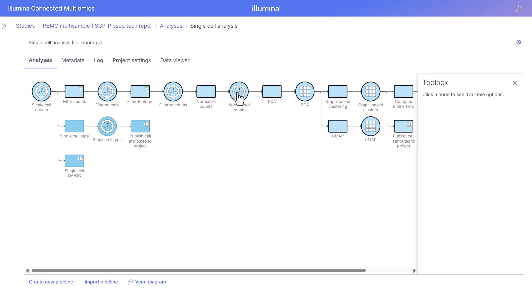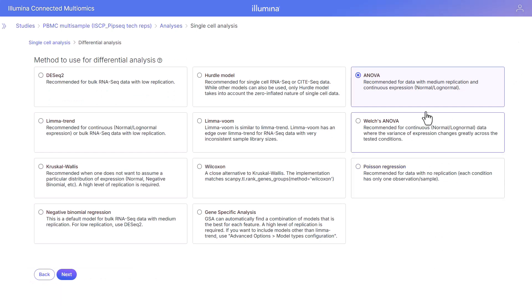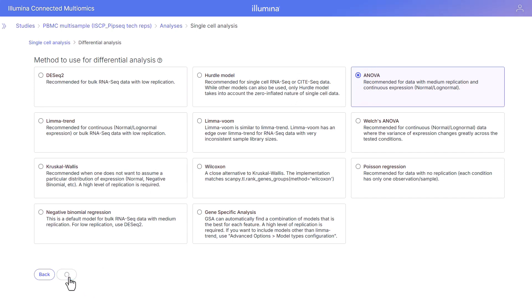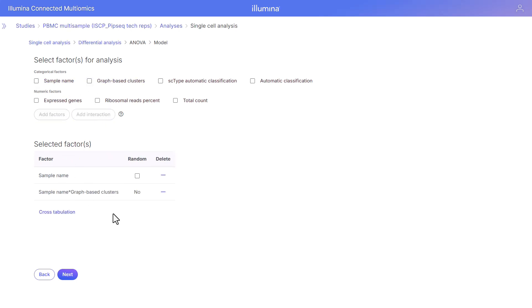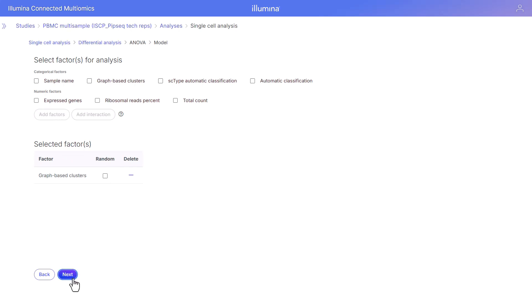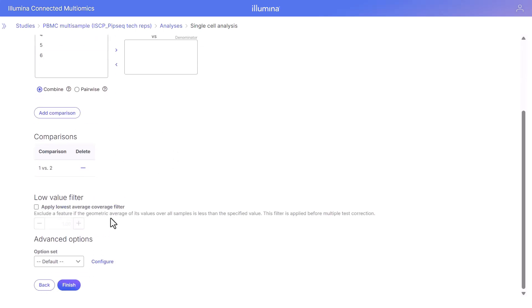Let's go ahead and make a comparison. For differential analysis, we select the normalized counts node and navigate to differential analysis under statistics. A variety of models are available including the hurdle model — I'm going to keep the ANOVA model for this demonstration. Different factors can be added, including individual factors like sample name or interaction factors. We're going to include just the graph-based clusters as our factor. We'll make a simple comparison: graph-based cluster one versus graph-based cluster two. We don't need to do any filtering since we've already filtered upstream, and click finish.